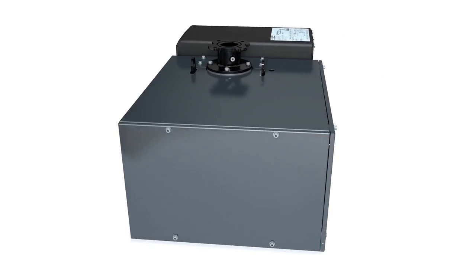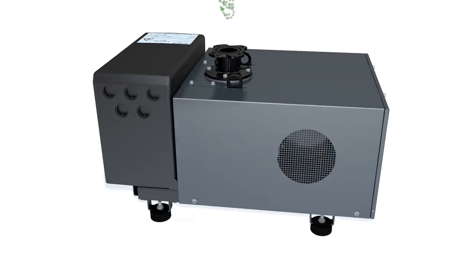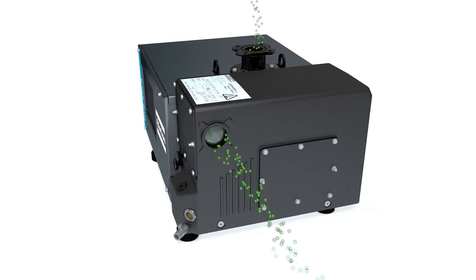Atlas Copco's GVS A-Series, a full range of oil-sealed rotary vane vacuum pumps that set new standards. Here's how they work.